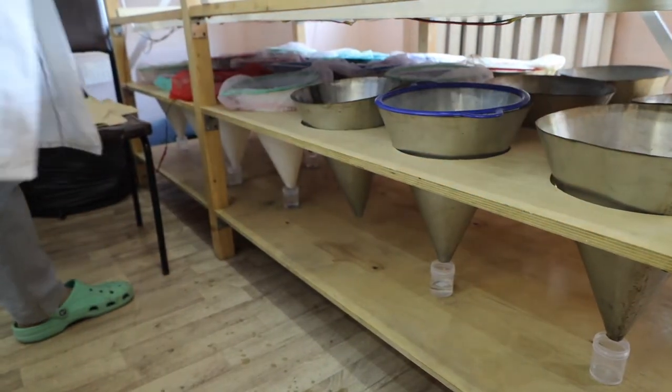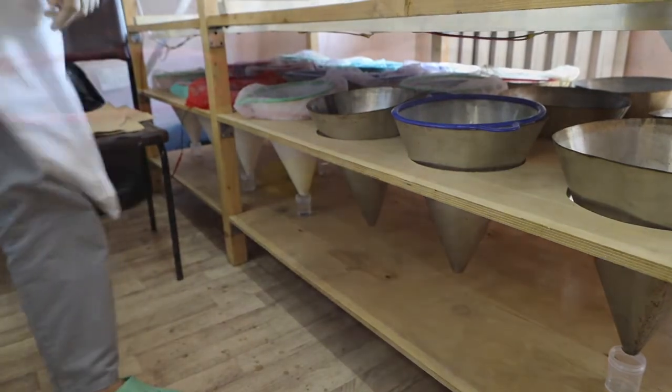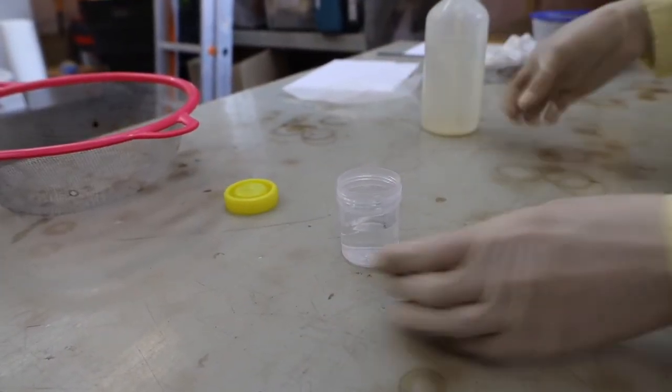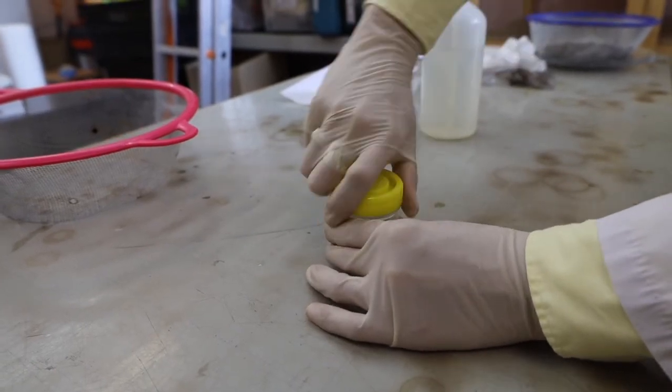When the extraction is finished, we remove the vials, fill them with 96% ethanol, and close them. Don't forget the labels and store vials in the freezer.